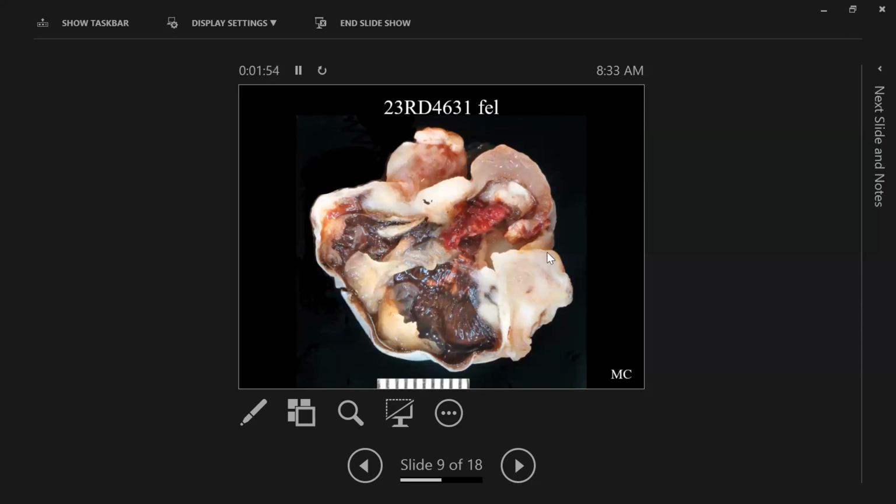Okay. Gap, bulgy translucent tissue, which is not cornea, and we'll see later. No evidence of a lens, detached and torn retina. Hopefully that helps for the folks watching at home. Okay. So that's the gross.